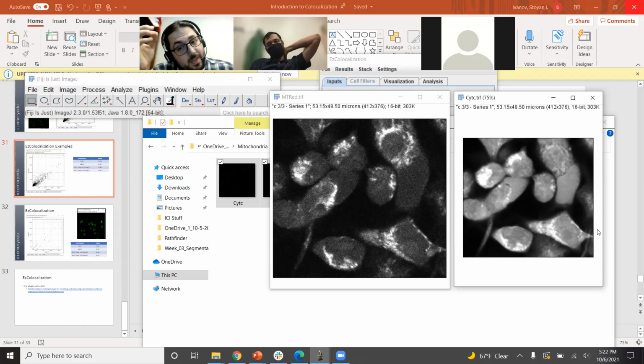Usually, if your image is not all structures, you'd want an ROI, because as you include any of the dark background in a fluorescent image or a set of images that you want to co-localize, you're doing several things. You're adding some noise, and you're also increasing the size over which you are then running the calculations to establish co-localization.